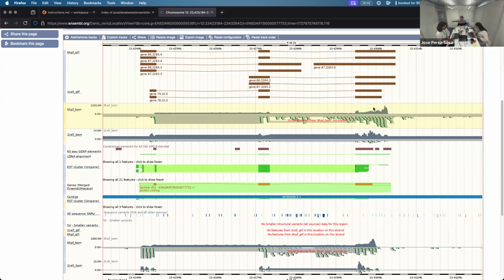Sorry, let me start again. The gray part is the coverage. The dark gray bit is the reads themselves aligned. Okay, you can see the traditional RNA-seq stair-like pattern cascading. And this is the coverage. It is still huge, actually more huge. It's 1,200 at its peak, which means that this particular region of the genome has that many stacked reads, essentially.